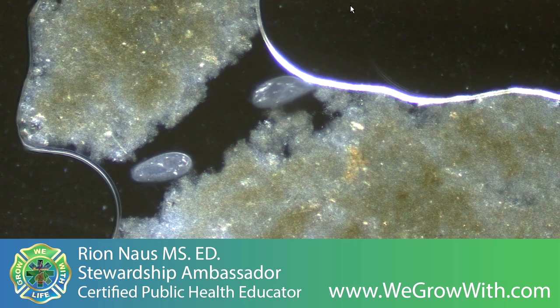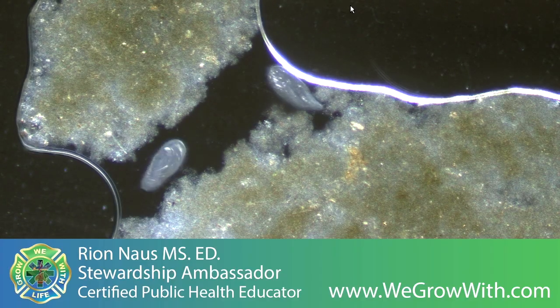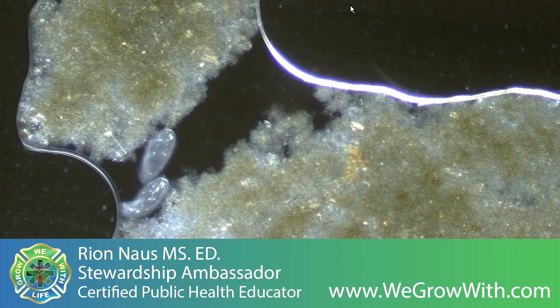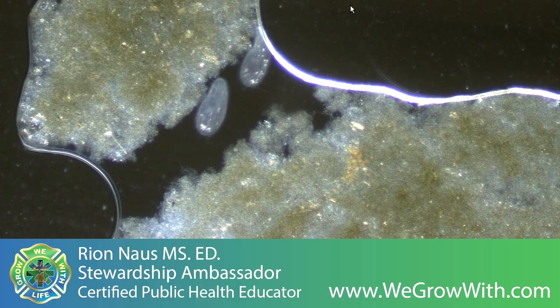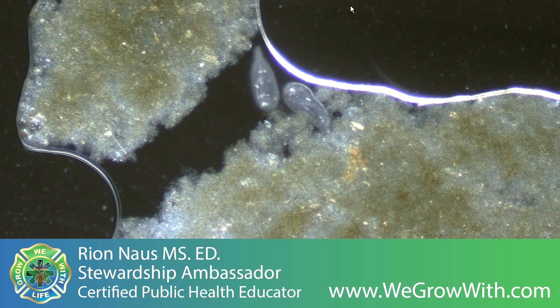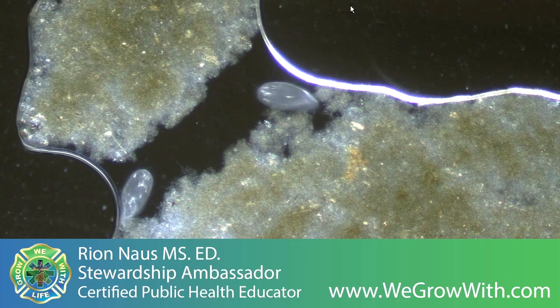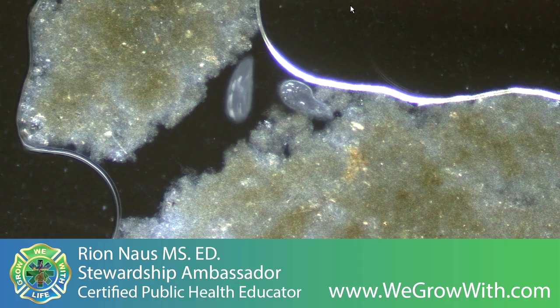Usually I don't have the opportunity to record for this long. But this technology has allowed me to share more. Usually it requires being here. Clips and snippets don't tell the story of watching this system, which is everywhere and fascinating.